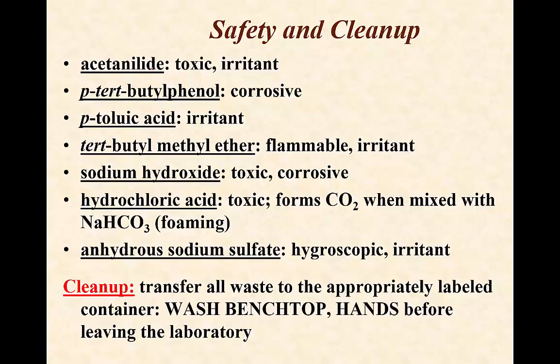Hydrochloric acid is toxic. Also be aware when you mix that into the layer with the sodium bicarbonate, it does form CO2 and it tends to foam up. So add it very slowly and carefully. Give it a chance to finish foaming before you add any more so it doesn't foam up and out of the container. And the anhydrous sodium sulfate is what is known as hygroscopic. So if you're not familiar with that term, it means that it absorbs water from its surroundings. That's the whole point of it, is we're using it to dry any water out of our solution.